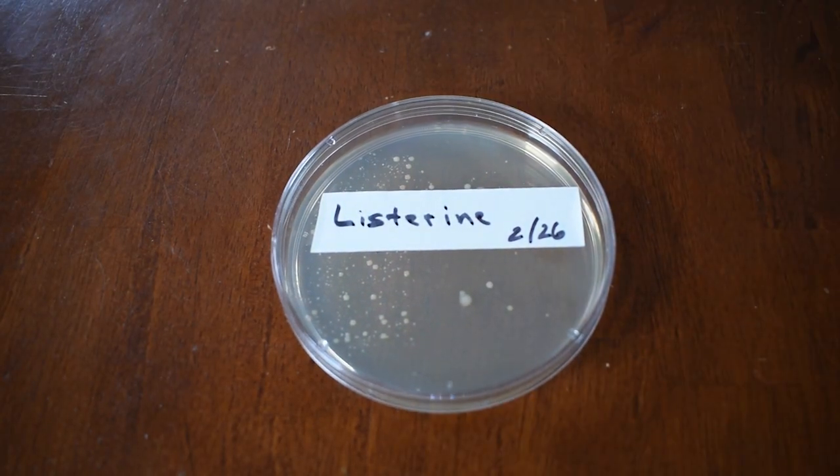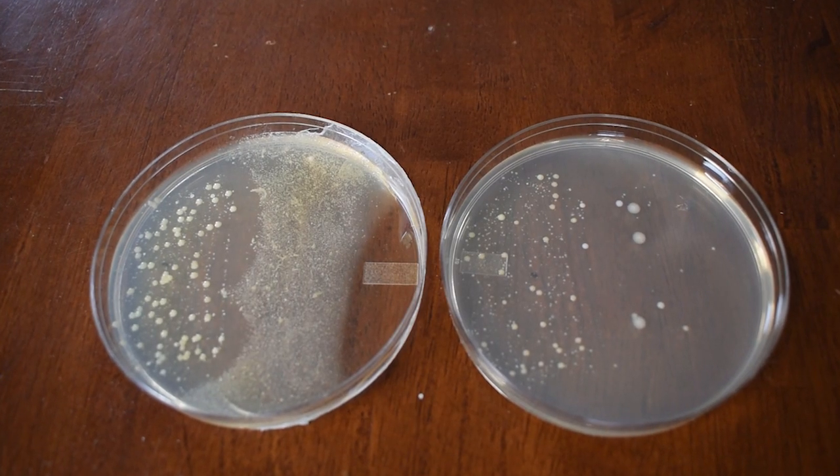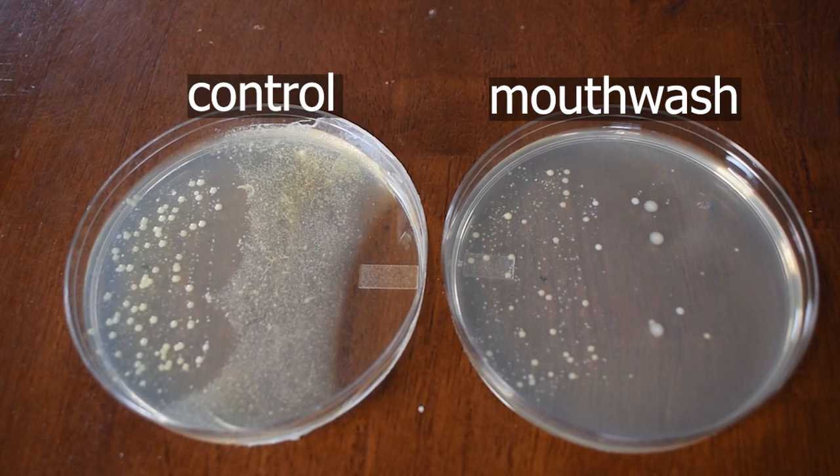Next up is the mouthwash plate. As in the previous video, there's less bacteria, but not a significant amount. When compared to the control plate, it's clear that mouthwash is not a very good stand-alone mouth cleanser.